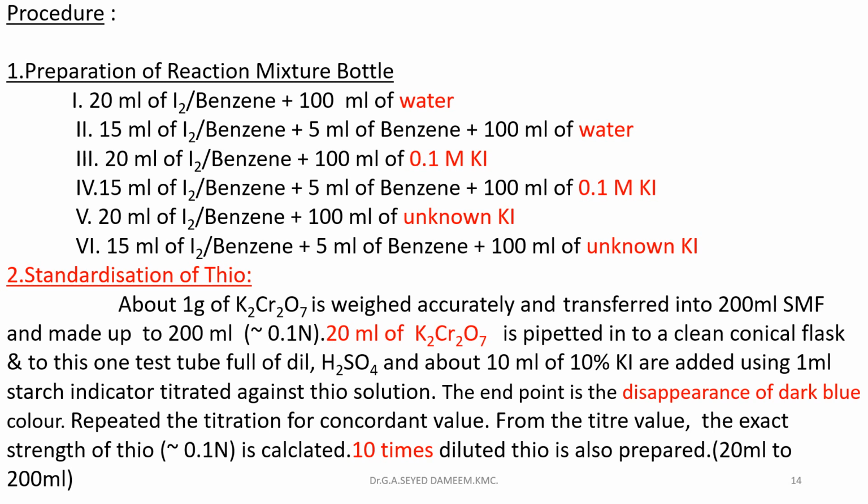In each bottle, the aqueous layer is exactly 100 ml and the organic solution is exactly 20 ml, so the total volume is 120 ml.